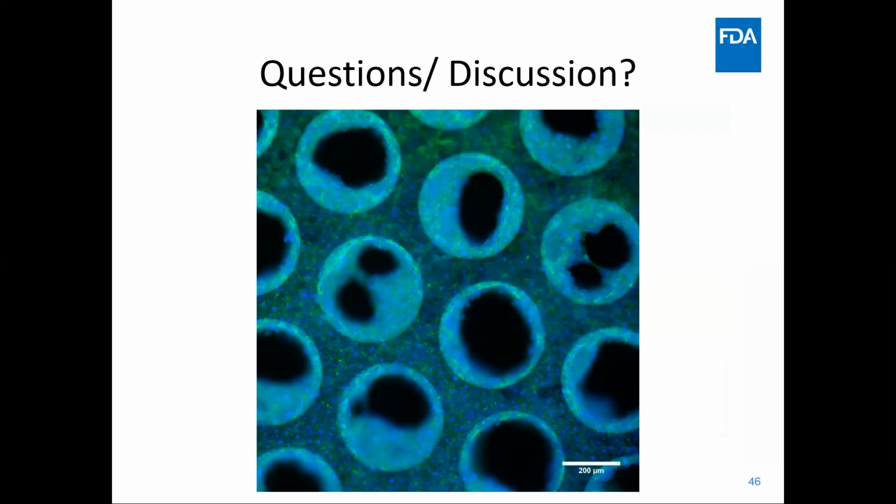Well, it's difficult for me to predict if it will ever be a requirement. I think what is a requirement in terms of making decisions during drug development is to do good science, to have good data, and to have data that folks that are evaluating that data have confidence in it. So I think as long as organs on chip, microphysiological systems, whatever technology, as long as it demonstrates to be predictive, I think then there's no reason not to use it, even without any requirements.